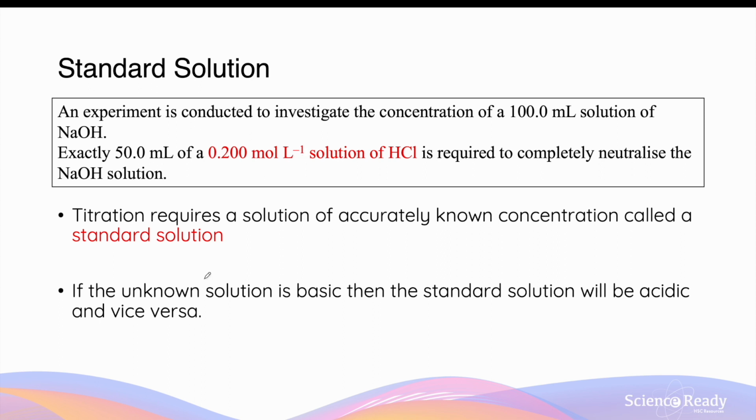If the unknown solution that we are trying to determine the concentration of is basic, then the standard solution will have to be an acid solution. The converse is also true. If the unknown solution is an acid, then the standard solution should be a base.